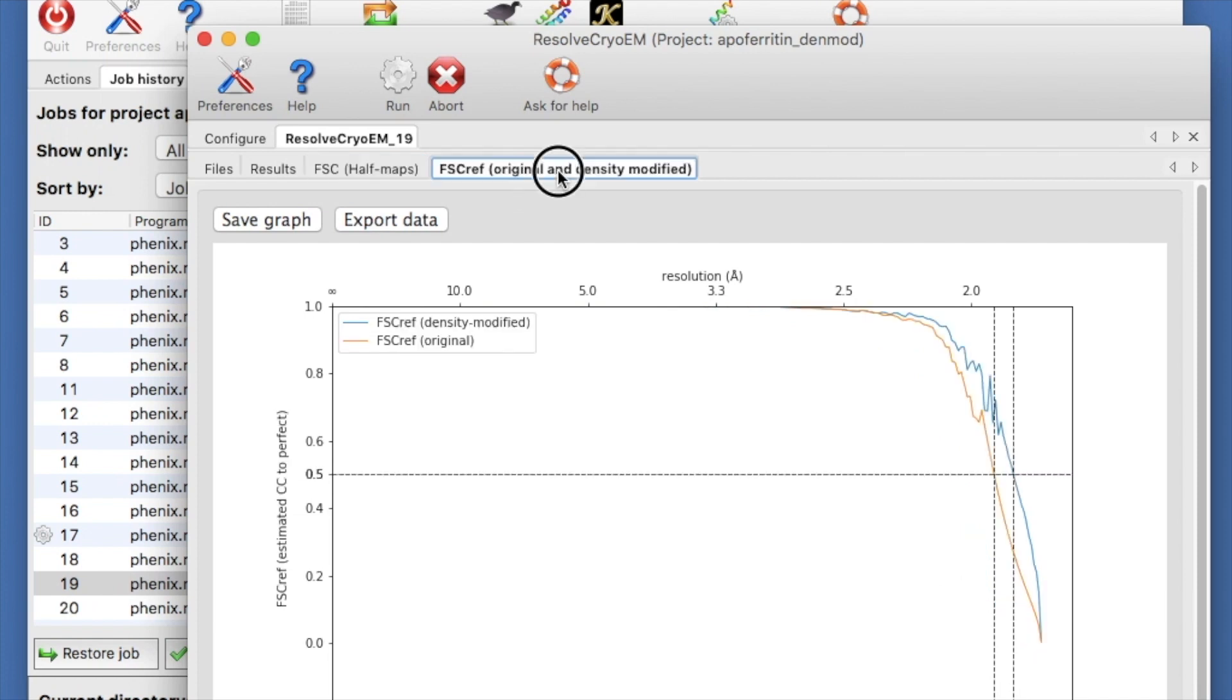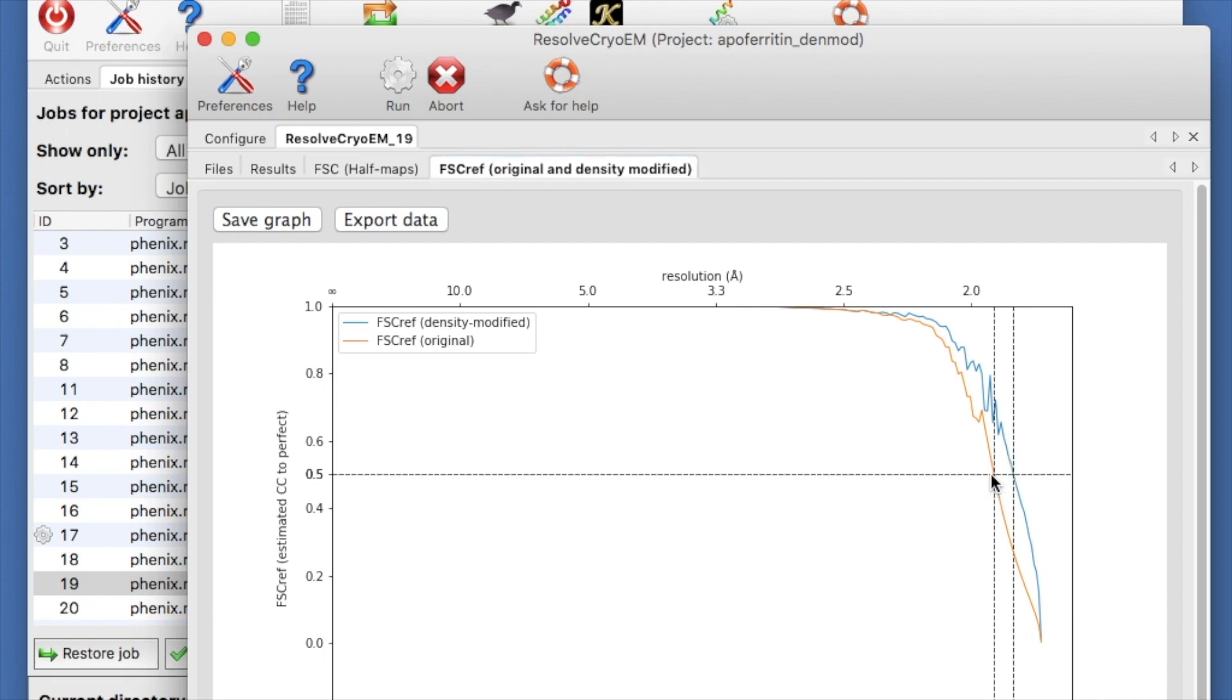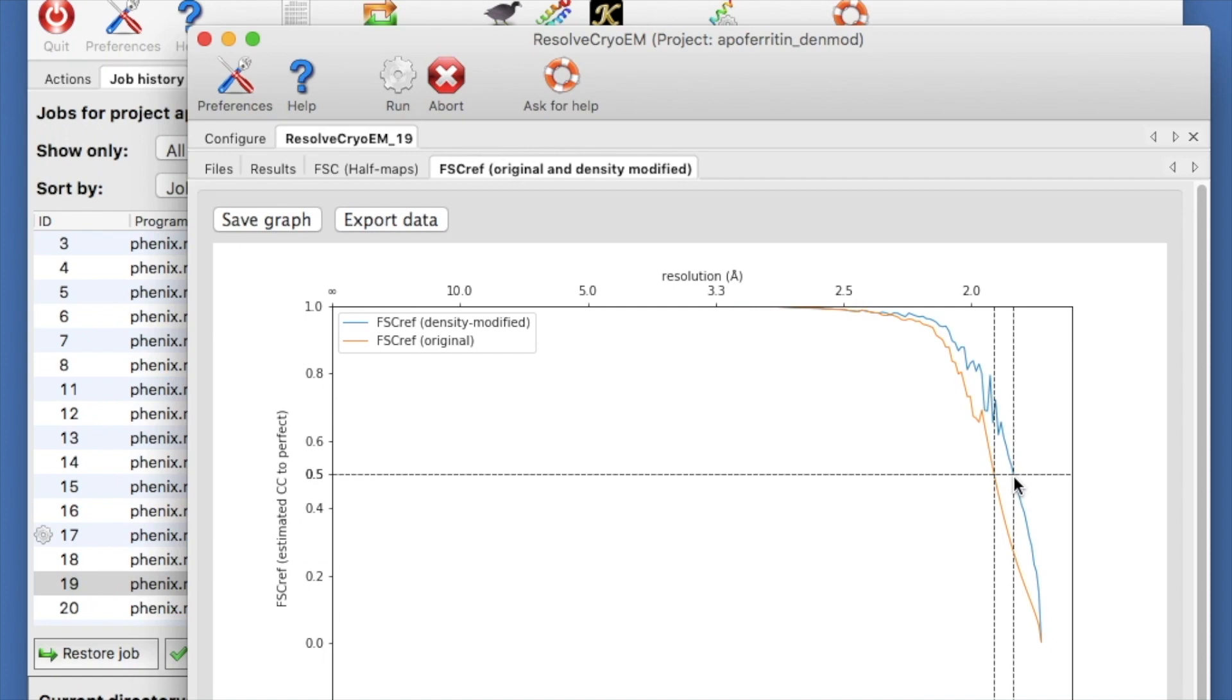The final tab shows the estimated map quality of original and density modified maps as a function of resolution. The light brown curve shows that the original map is about 50% correlated with the true but unknown map at a resolution of 1.9 angstroms. The blue curve shows that the density modified map crosses that threshold at slightly finer resolution. Notice that the blue curve is higher than the brown one at all resolutions between 1.9 and 2.5 angstroms. That means that the density modified map is better in this resolution range.